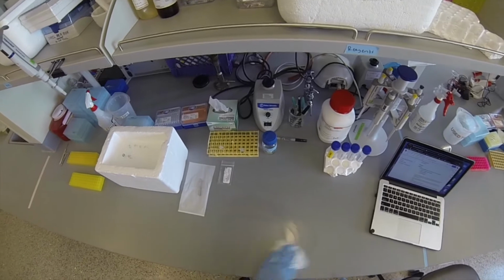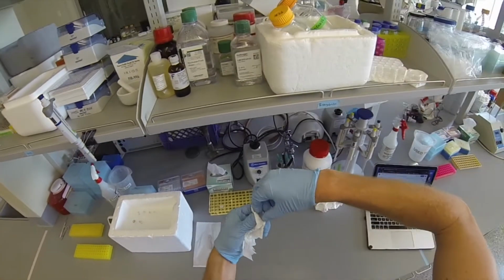Make sure to keep a clean lab bench throughout your extraction, and make sure to use 70% ethanol if needed.